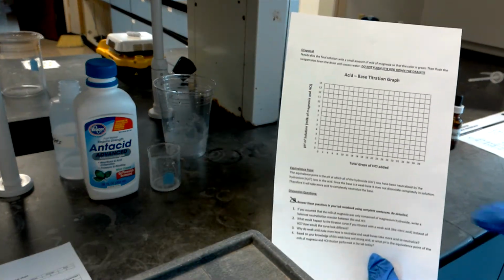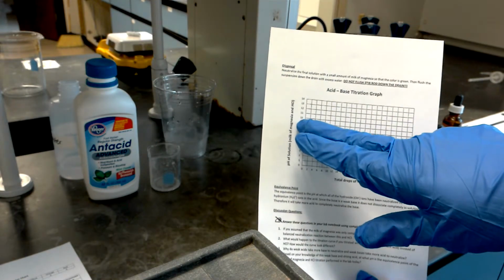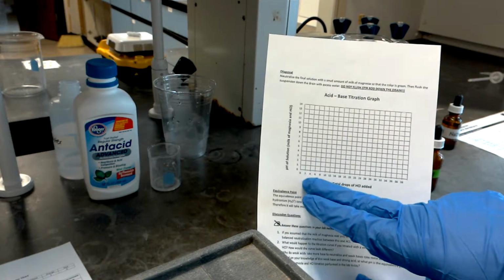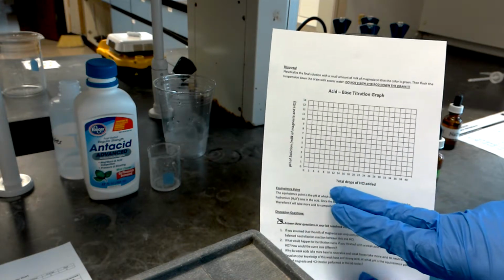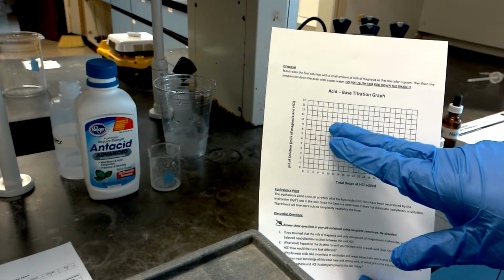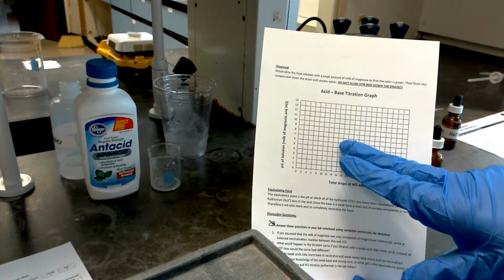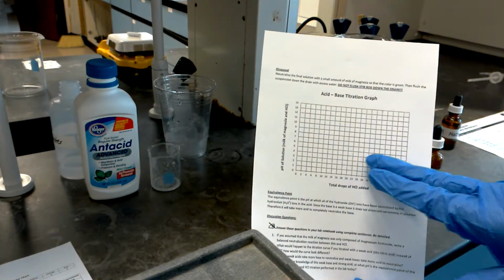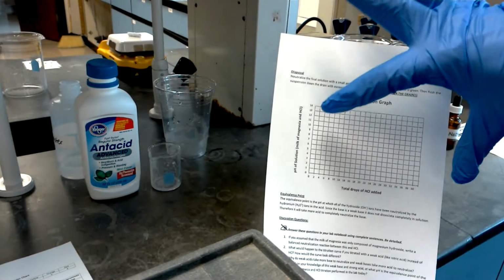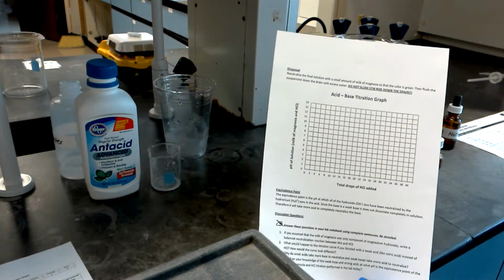So when you plot your data on this chart, you're going to start off with a pH of 10 for the first several data points, and that corresponds to however many drops we've added of hydrochloric acid. So you'll have a flattened portion of your graph. Then your graph will start to drop until it reaches a pH of 4, and then you'll have several data points that flatten out at 4 because that's the range of our indicator.